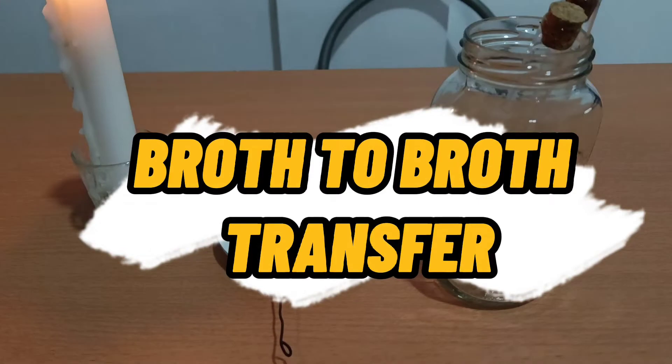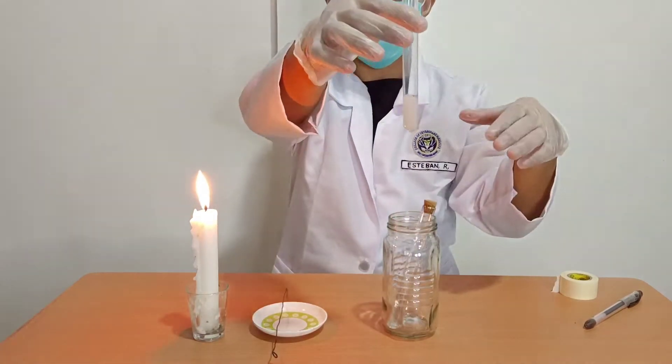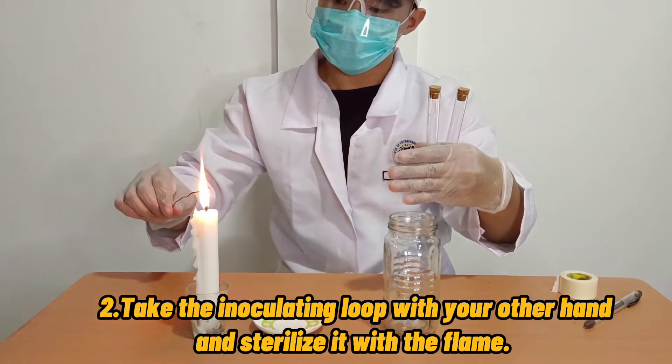First to do is the broth-to-broth Transfer of Cultures. First, using your left hand, hold the broth culture and a sterile nutrient broth. Second, take the inoculating loop with your other hand and sterilize it with the flame.